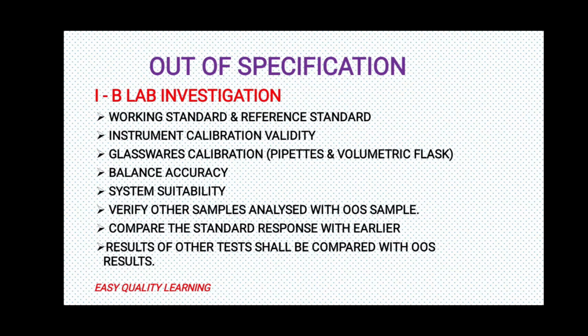Then working standard and reference standard need to be checked, that the validity of working standard and reference standard is in line or not.